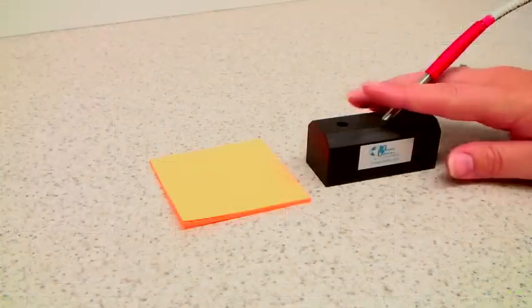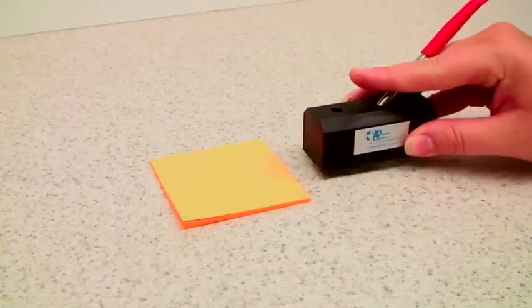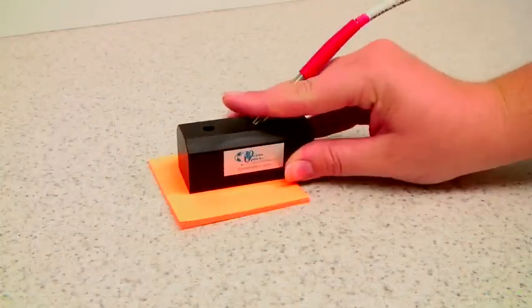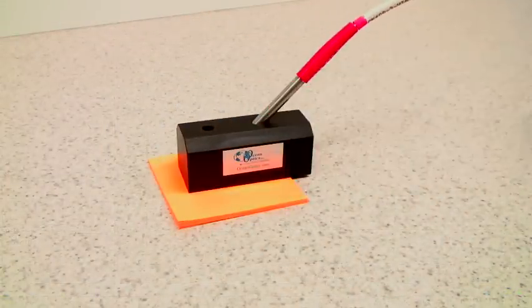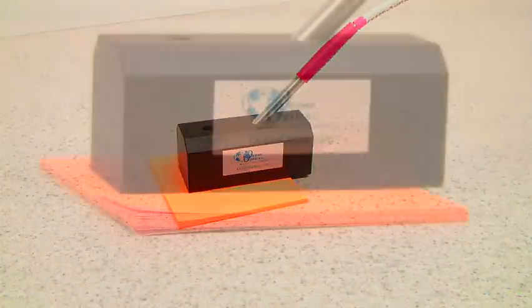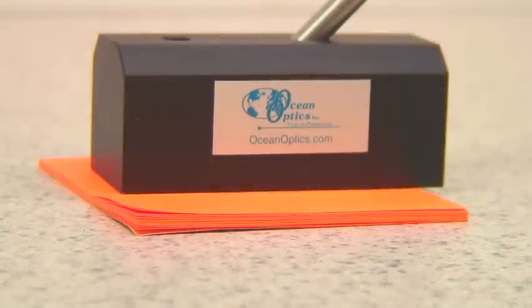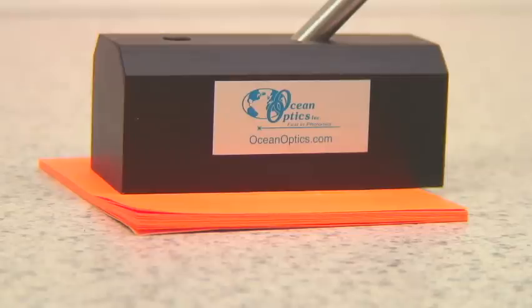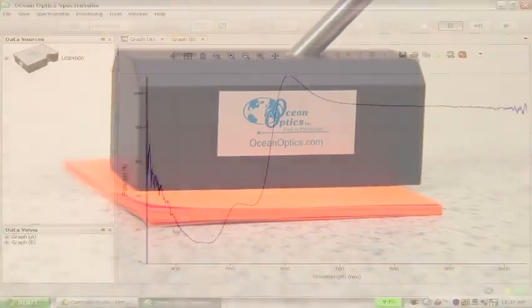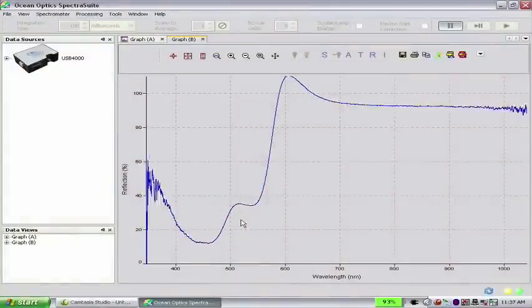Now place the RPH1 on the sample to be measured. In this demonstration, we'll be measuring an orange piece of notepaper. The reflection spectrum is shown in the graph pane.